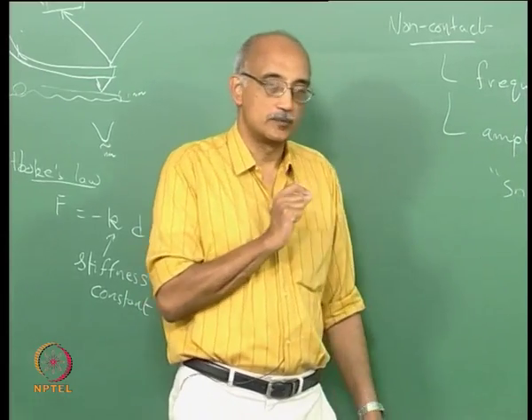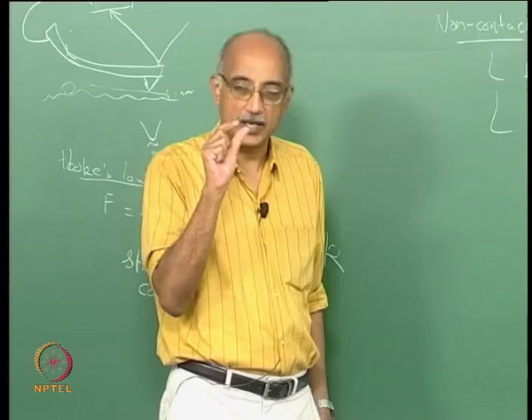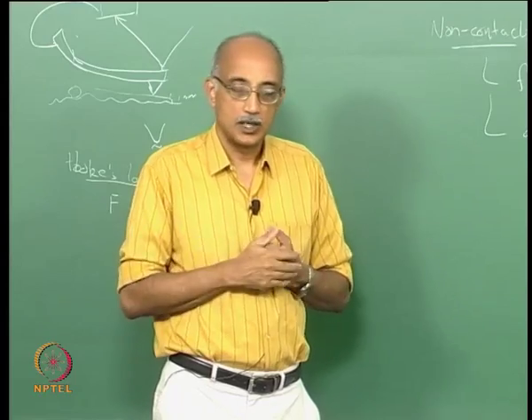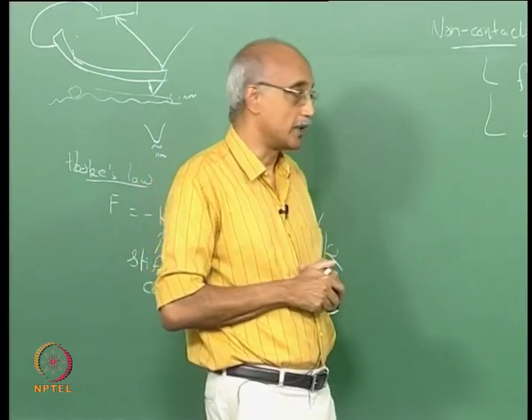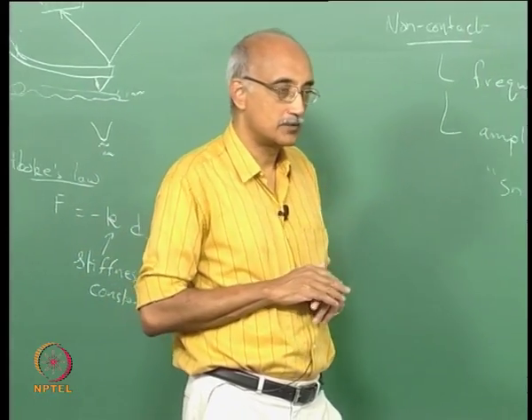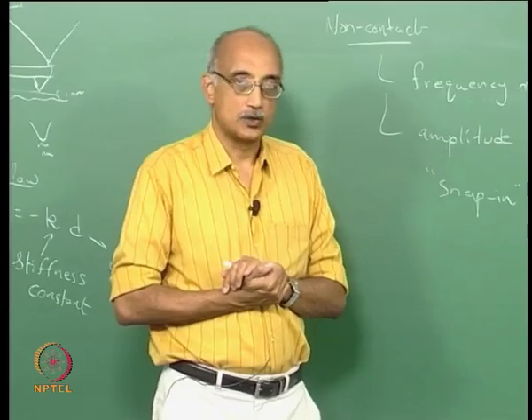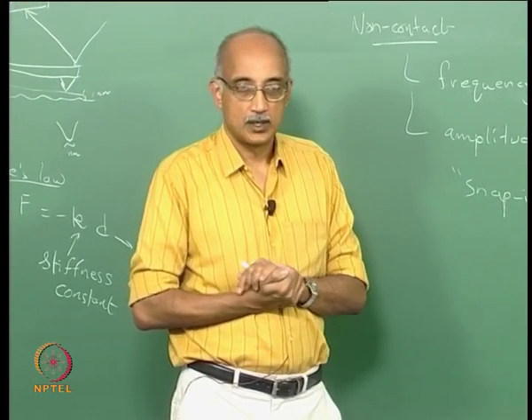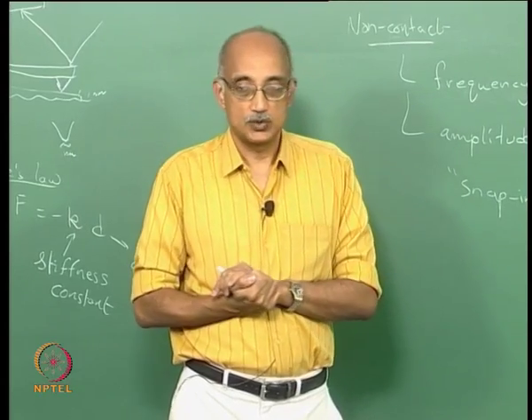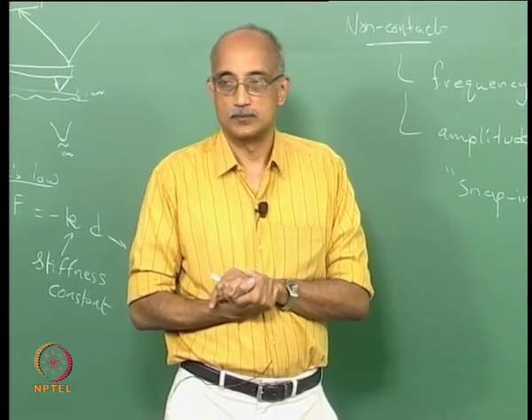The atomic force microscope, because it's actually a contact probe measurement, you're really only looking at very, very fine regions at a time. You characterize micrometers at a time. So if you have a large surface and you try to characterize the entire surface using an atomic force microscope, it will take you forever. So the speed of analysis, the depth of field, as we call it, is much better for an electron microscope compared to an atomic force microscope. But apart from that disadvantage, there are many benefits to using atomic force microscopy. So it remains a very popular surface characterization tool.